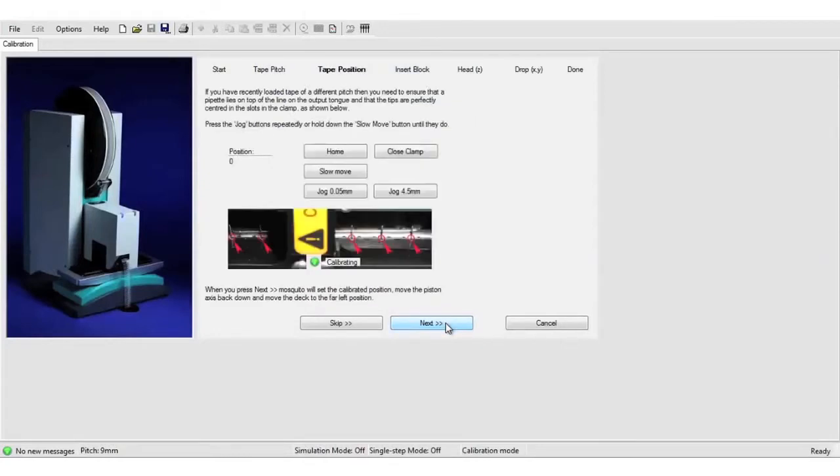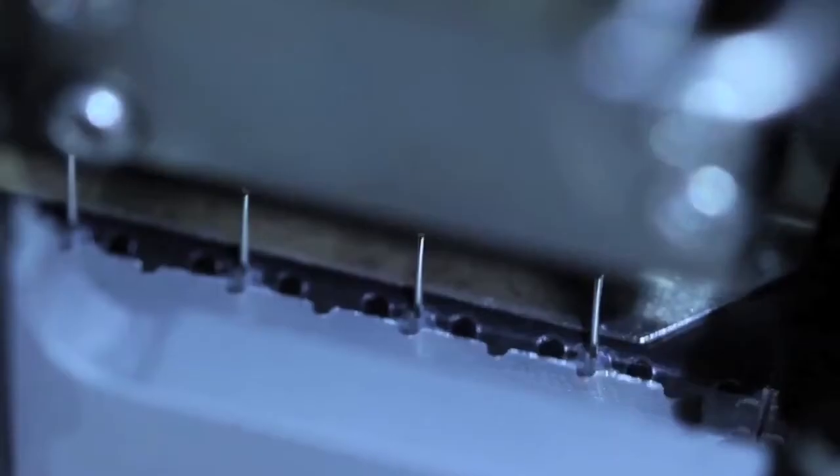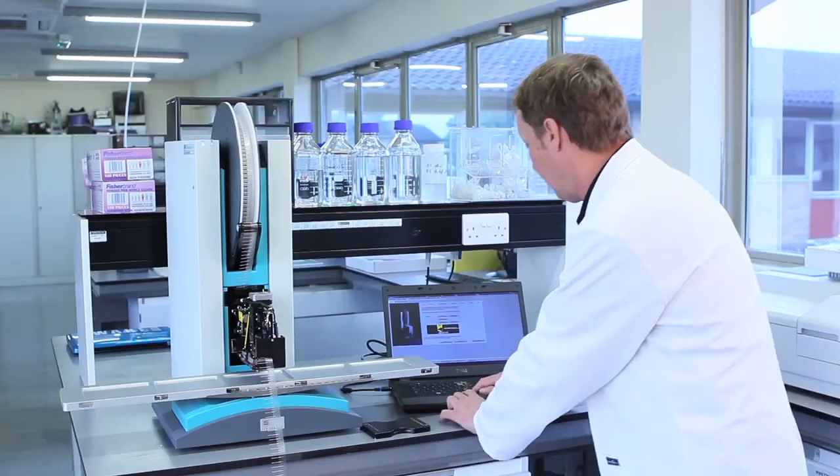At this step, we're looking at the position of the tips within the head. We can open and close the clamp to check the position, which looks good. And click next.